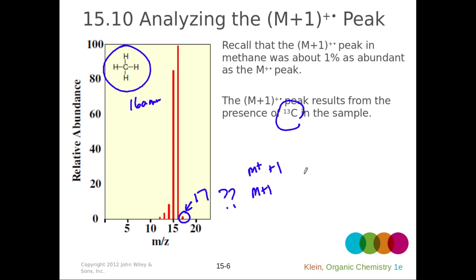So the different isotopes of the different molecules don't hit the detector at the same point. The different isotopes of atoms are separated in a mass spectrum, because these isotopes have different weights. So carbon-13 has a different weight, and it's going to hit the detector at a different point, but we don't have as much carbon-13 in nature. It's not as abundant in nature as carbon-12.